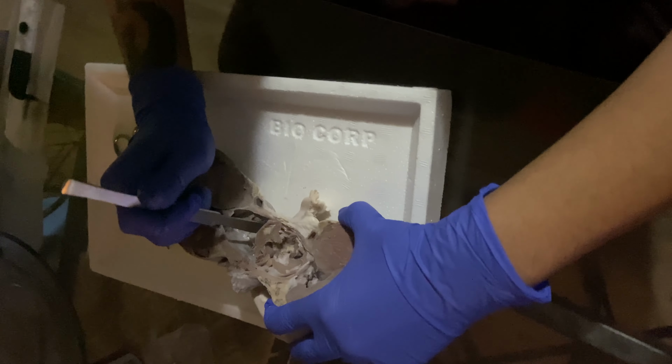You also have three layers. You have the epicardium, this thin epicardium, and then this thick myocardium, and then you have a very thin layer on the inside, which is the thin endocardium. So three layers of the heart.